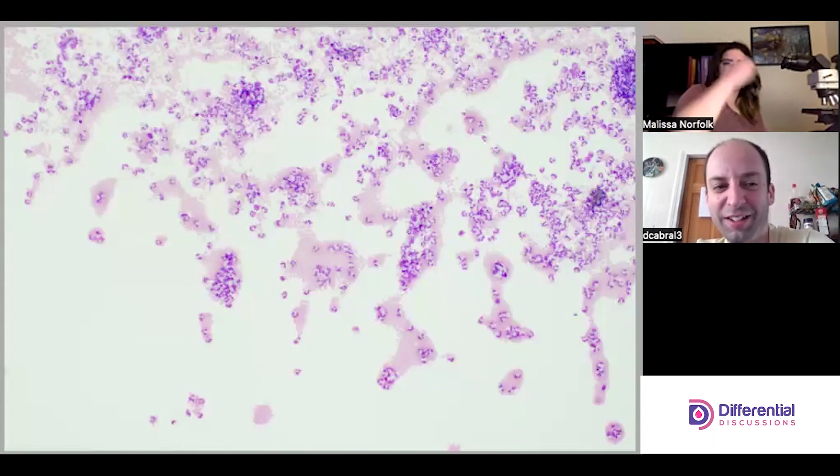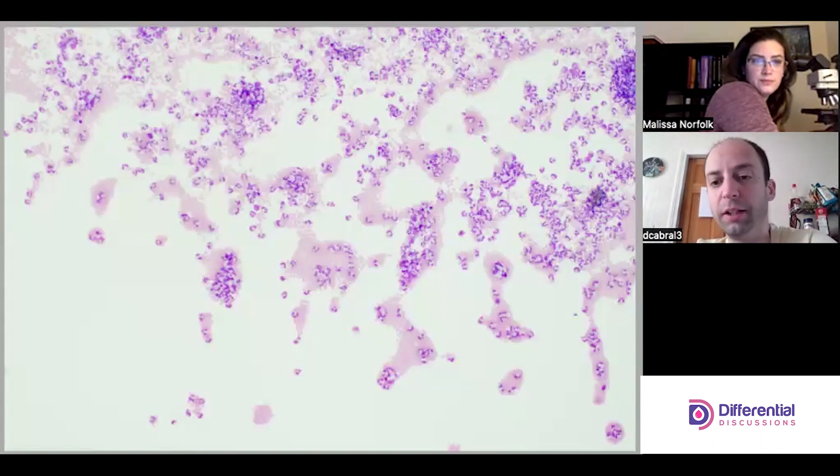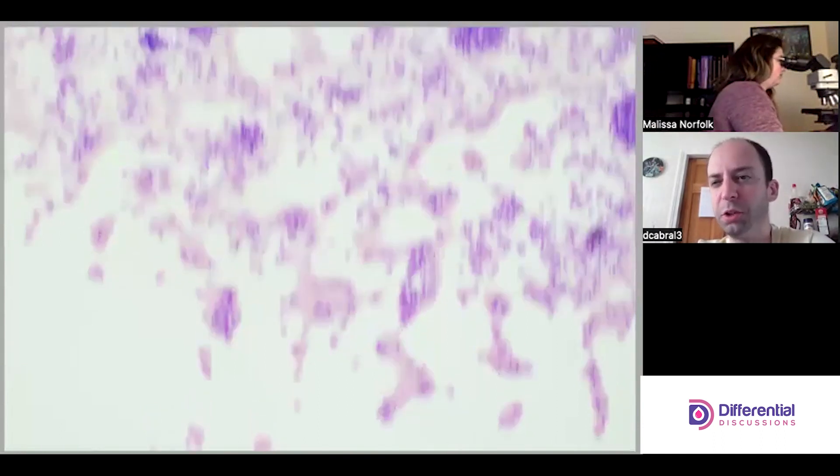So we're on low power and I can see lots of nucleated cells. I can see quite a bit of red cells too. That's not typically super significant in a synovial.